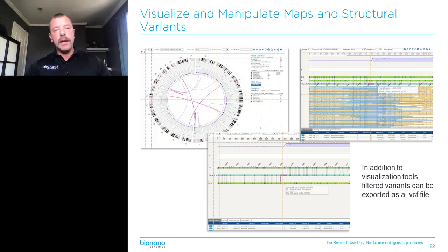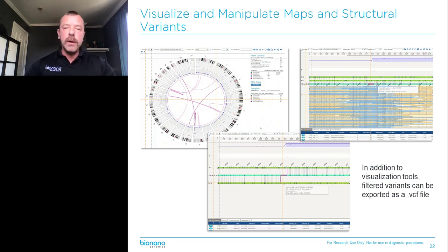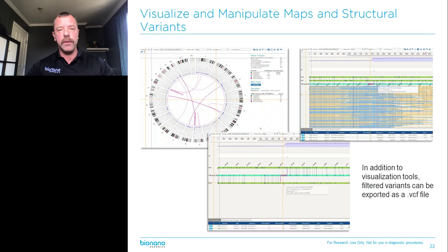When you click on any of these items, you're taken to a map where you zoom in on the exact breakpoint. You can see the copy number change on top and the translocation right there in the middle. We can even show you the individual molecules that we imaged that align to that structural variant as evidence. If you don't want to work with our software, you can export all of our data as a VCF file and work with any software package of your choice.